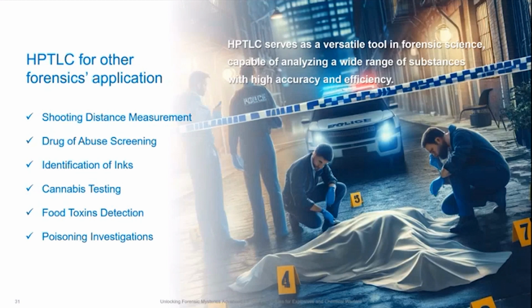Then food poisonings. We have cases of cassava poisoning, for example, where manioc, as it's called as well, where the people in the village are eating manioc that has toxin inside and was not prepared well. So there we can check the raw materials for toxins. So as you see, we have a lot of applications.